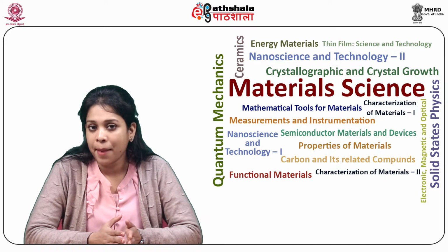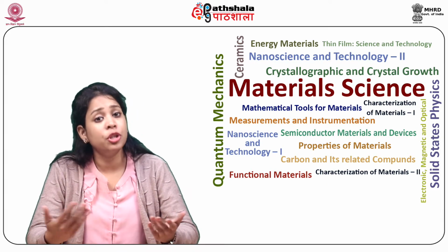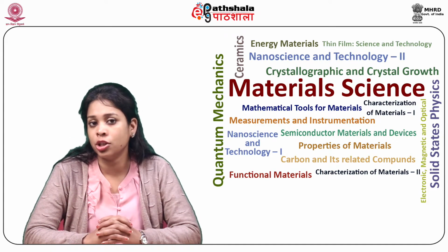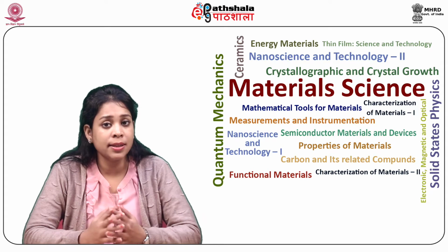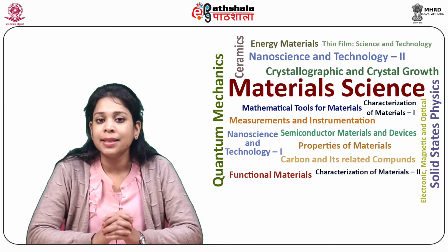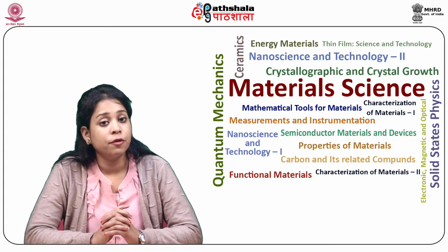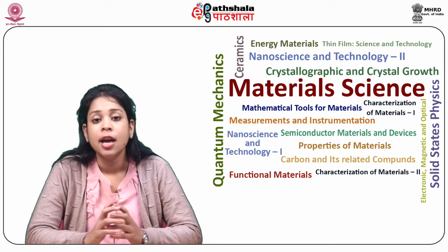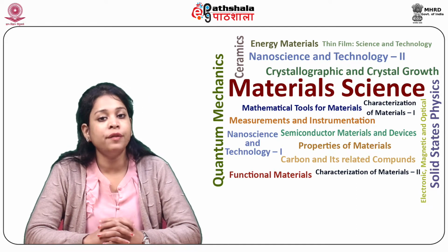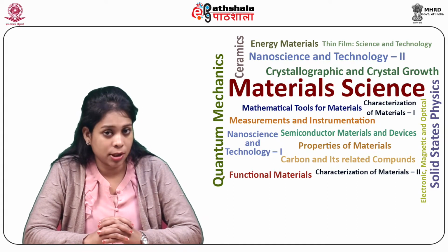The transverse magnetization can be produced by applying coherent electromagnetic radiation at a resonant frequency, for example a 90-degree pulse. The maximum magnitude of transverse magnetization is equal to the equilibrium magnitude of the original Z component.